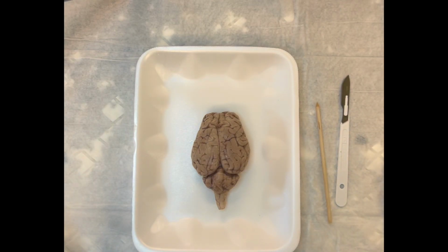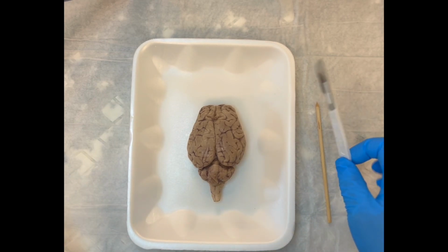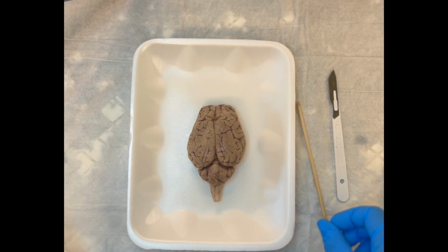This is a video for the sheep brain dissection. So what I have in front of me here is a nice clean brain. I have a scalpel blade and a wooden probe. And that's really all you're gonna need for this activity.